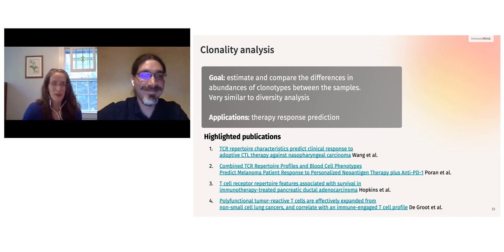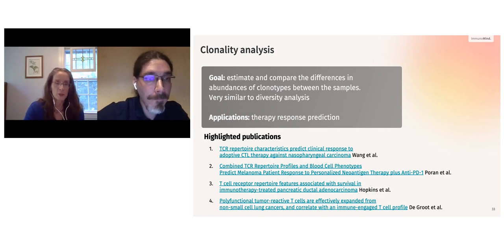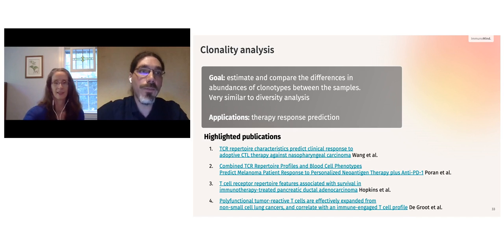We had a quick refinement of the original question about merging technical repeats, and what was meant was more if it's possible in Immunarch or if it must be done manually. Yeah, so not yet. If you have some suggestions, if you have best practices on how to do it, please contact me. Our team will be happy to implement these best practices to help researchers.